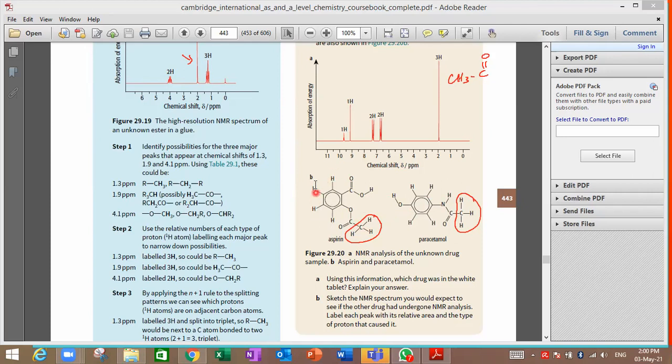These two are one environment. So 1, 2, 3, 4, and 5. We have 5 peaks. What about the other? Here we have 1, 2. These two are similar. 3. These two are similar. 4, and this one alone. Also, it has 5 environments.